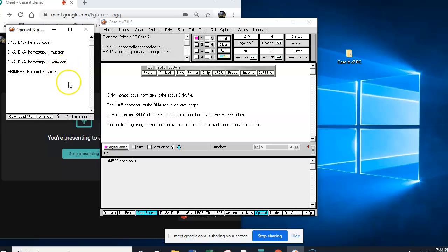Think of this as your benchtop. You have some DNA in a test tube there, you've got some primers, and we'll just assume we have the PCR mix somewhere. This is the actual sequence of the primers. If we actually took these sequences and did a PCR, we would amplify this gene. They're like the real primers. FP stands for forward primer, and RP stands for reverse primer. Whenever you do PCR, the primers have to be pointing towards each other, and they'll amplify whatever DNA is in between them. And so we have these things now.